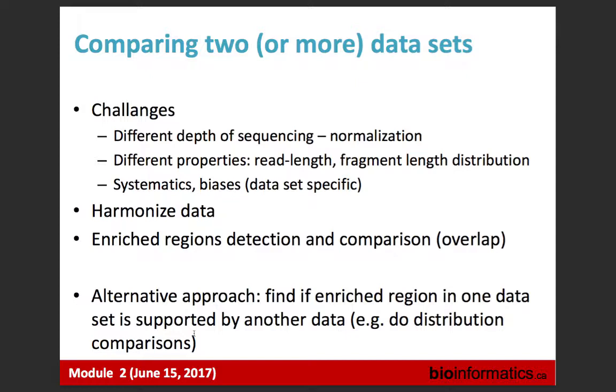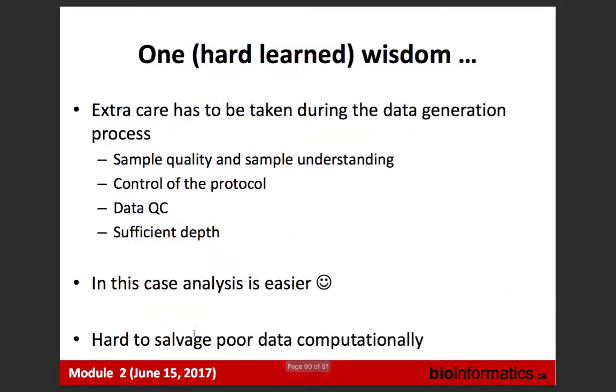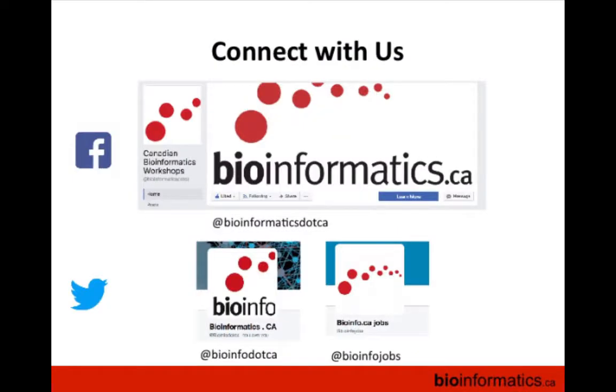That's an idea. And basically, just to second Martin: garbage in, garbage out. One of the wisdoms we learned the hard way when dealing with ChIP-seq is that special care should be taken at all QC steps and alignment steps, because if something went wrong in any preliminary step, then the analysis step has no value. Thank you.